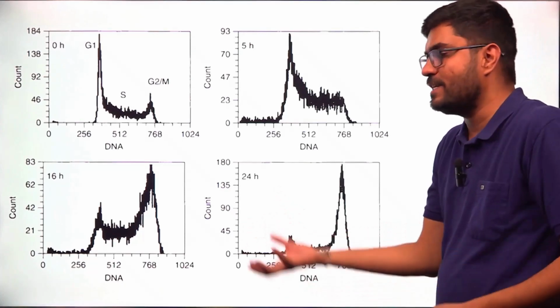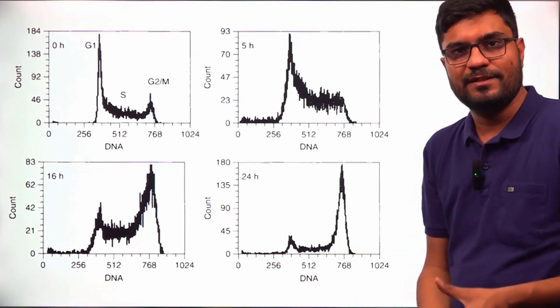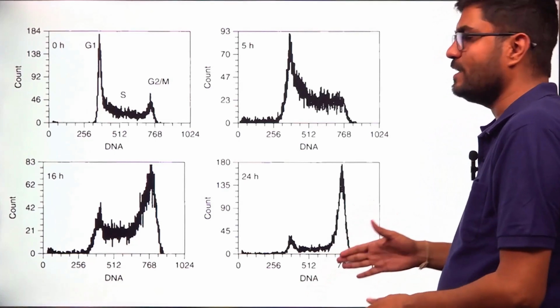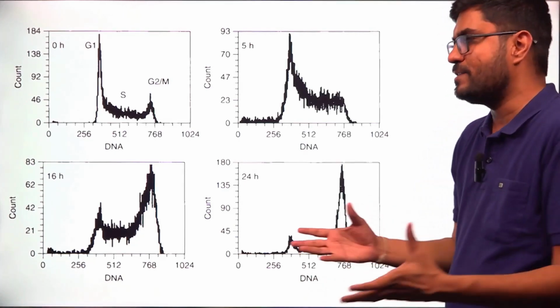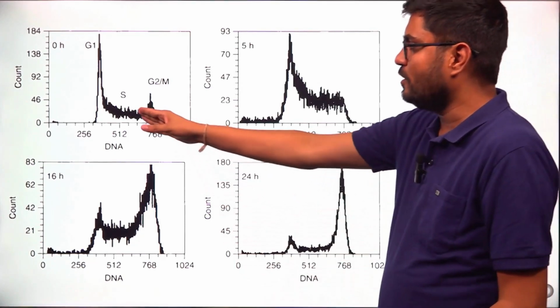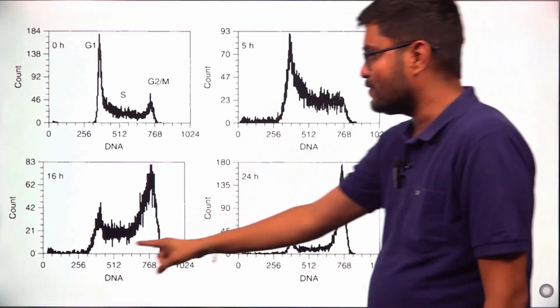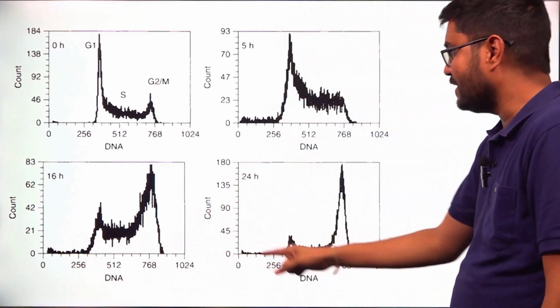G2 phase. So we can say that platinum carboxylate is a G2 blocker, blocking the cell cycle at G2M phase. Very simple to understand. At 0 hours, all three phases are there. At 5 hours, you can see some cells are dying also. They are undergoing apoptosis, right?